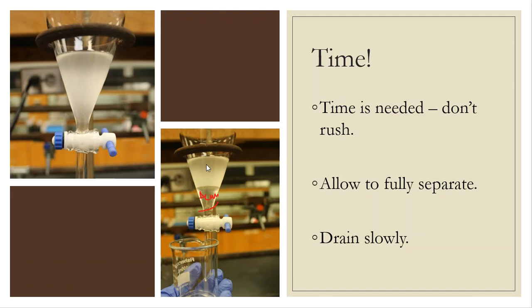I know this a couple of ways. I can use density in order to do that, or when I add my methylene chloride, I can see which layer gets bigger. Does my cloudy layer get bigger, or does the clear layer get bigger? And I honestly see the clear layer getting bigger when I add the methylene chloride in. So I know that that is my methylene chloride that is extracting my alkane out of that aqueous solution.